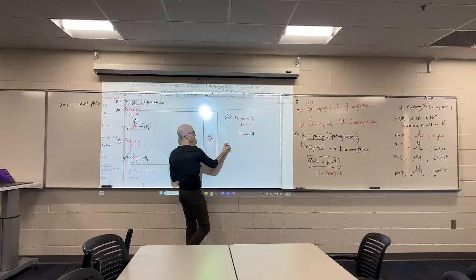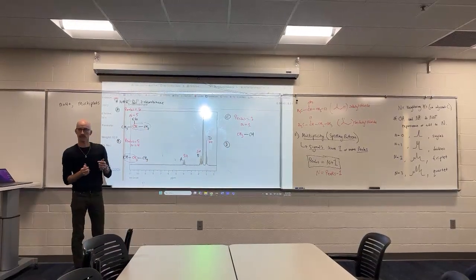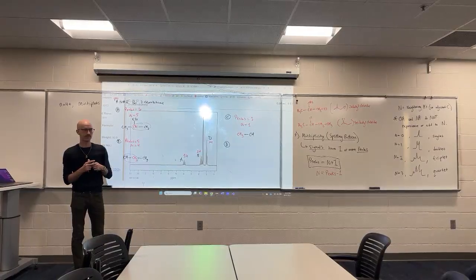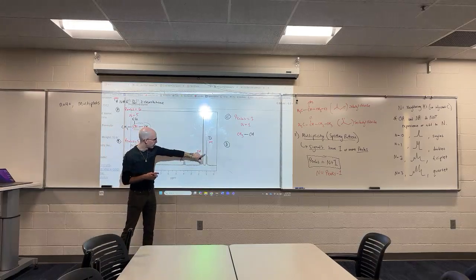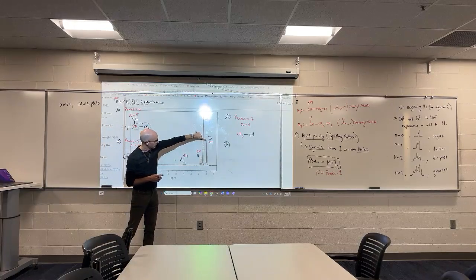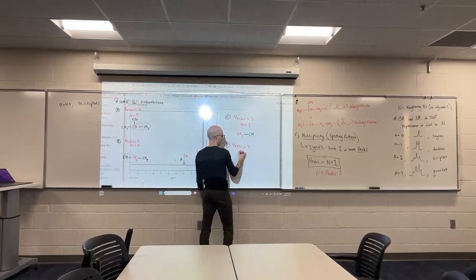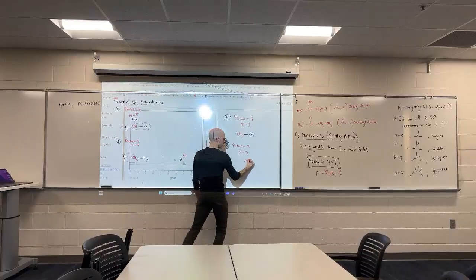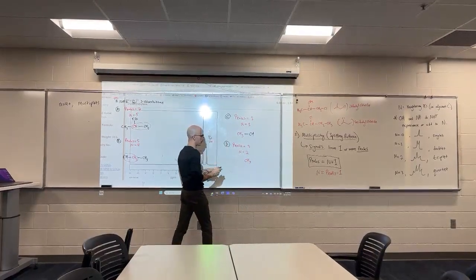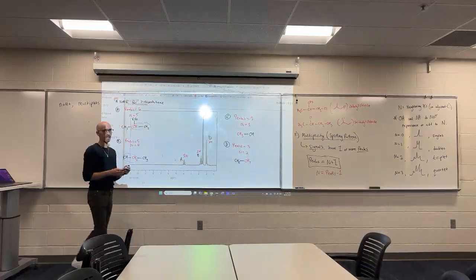Signal D, how many peaks? This one's much more clean. 3 peaks. 1, 2, 3. How many neighbors? Who are those 2 neighbors to this CH3 group? Well, it can only be a CH2.